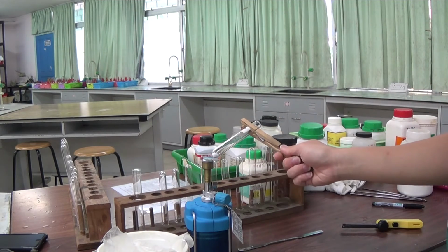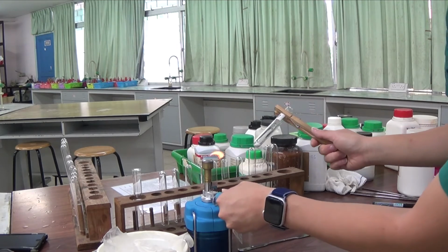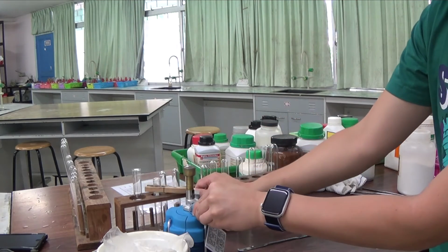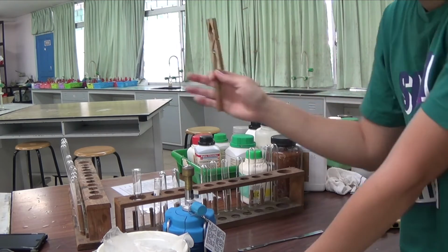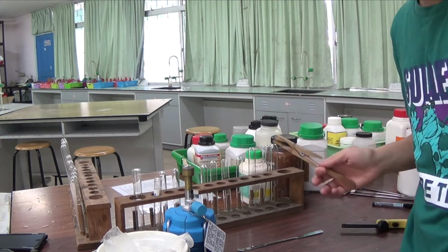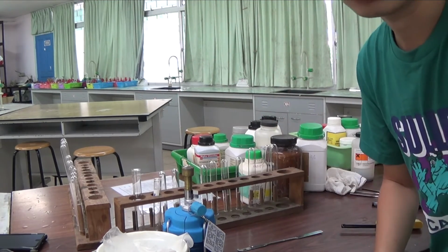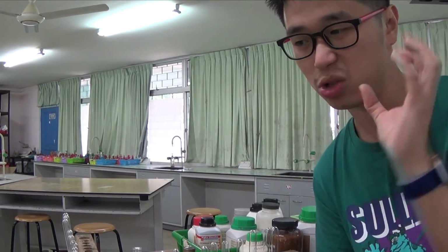Okay, so after I dry out the water of crystallization, it does not matter anyway. Ideally speaking, they could really ask you the thermal decomposition or driving off the water of crystallization for each and every one of these hydrated salts, but that is actually not the focus of my tutorial in this video.